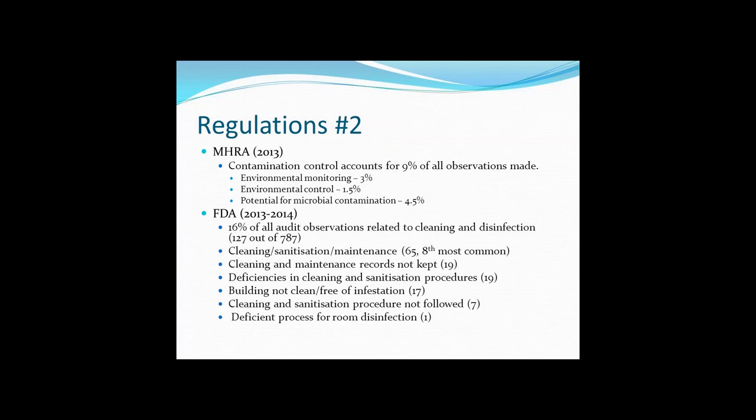It also stands that cleaning and disinfection issues feature prominently in regulatory audits. Now the MHRA don't go into a lot of specifics, but they do occasionally put up lists of non-compliances, and the last time they did that was in 2013, and I had a look at that and plucked out those ones which are of relevance to cleaning and disinfection.